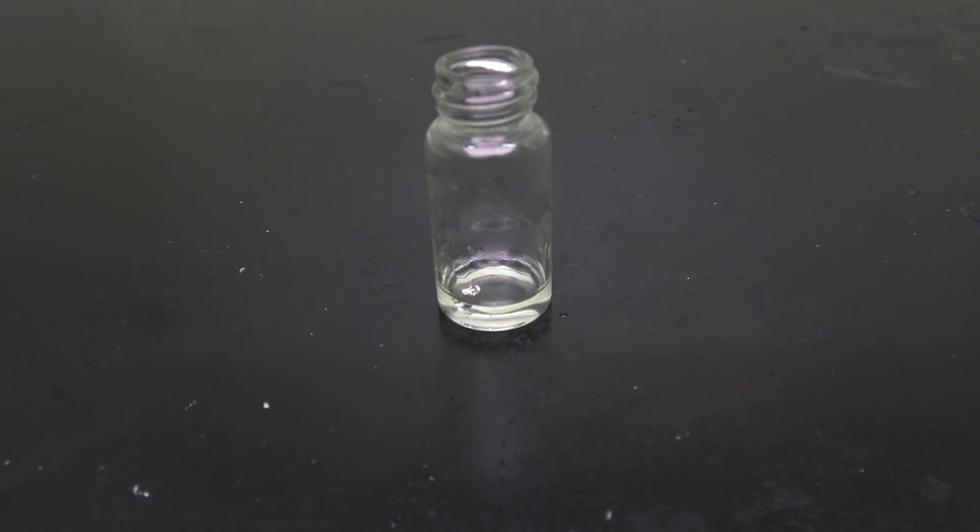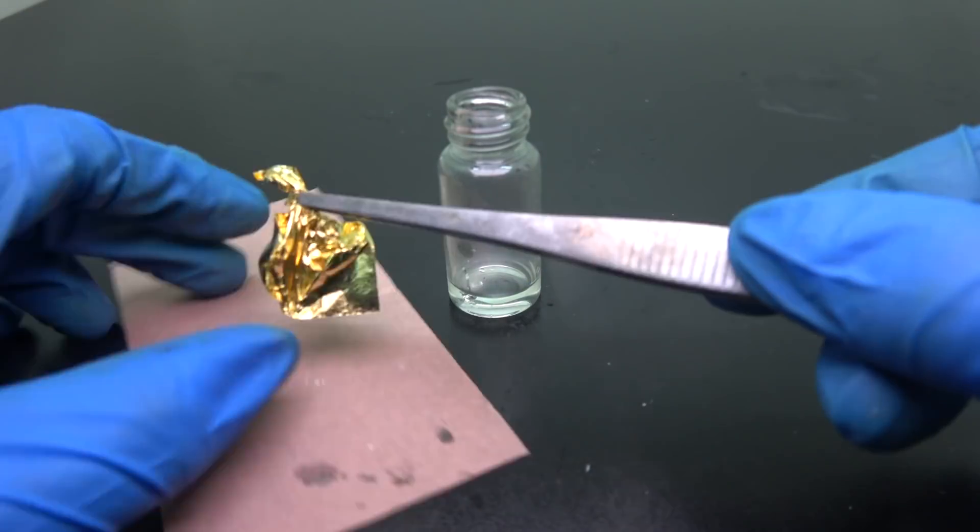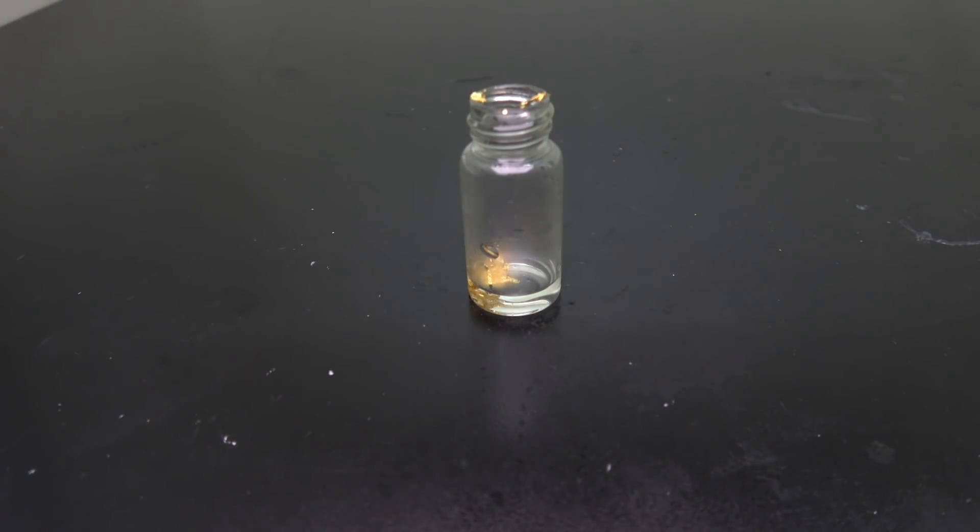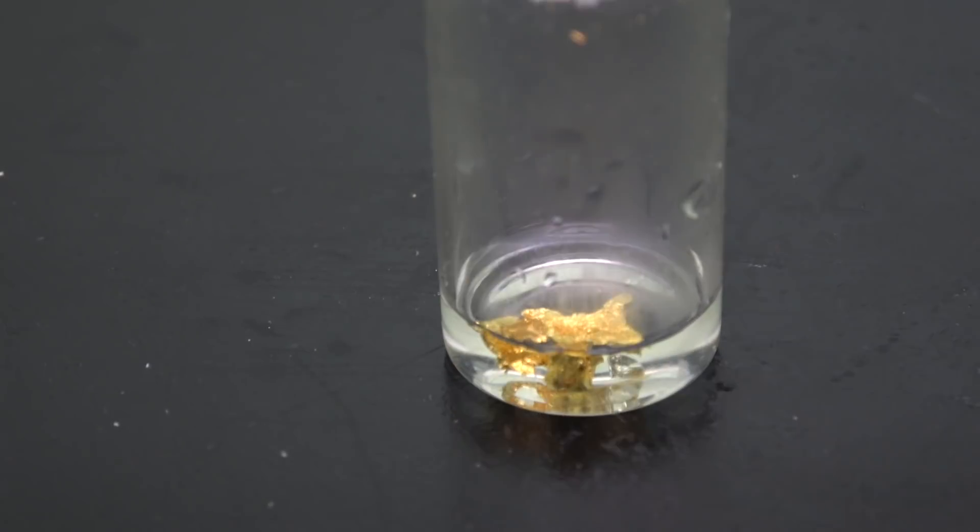It is well known for being able to dissolve noble metals such as gold and platinum. In order to demonstrate how different aqua regia is from its individual components, I'm going to throw in a piece of gold leaf.